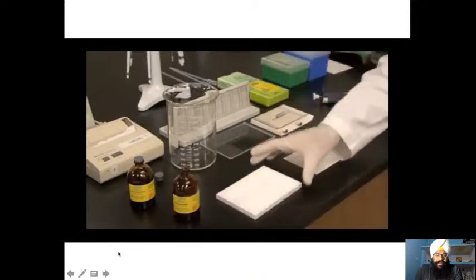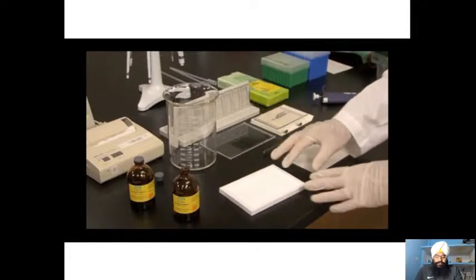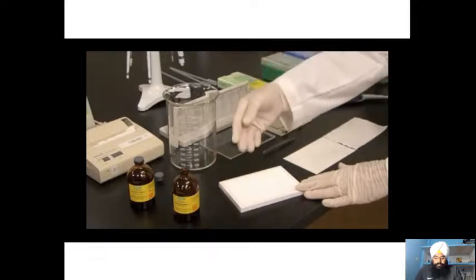Place the rehydration tray onto a shaker rocker table for 15 minutes. Note that the rehydration tray has an angled end and a straight end. Whenever you're pouring out liquids, use the straight end so that it does not slide out of the tray.